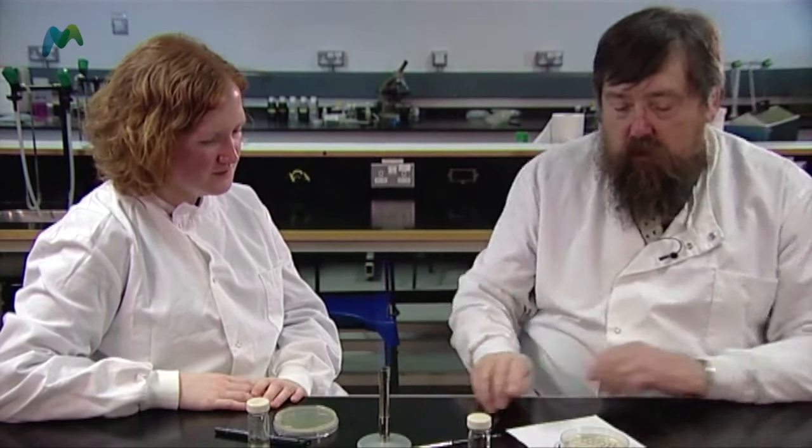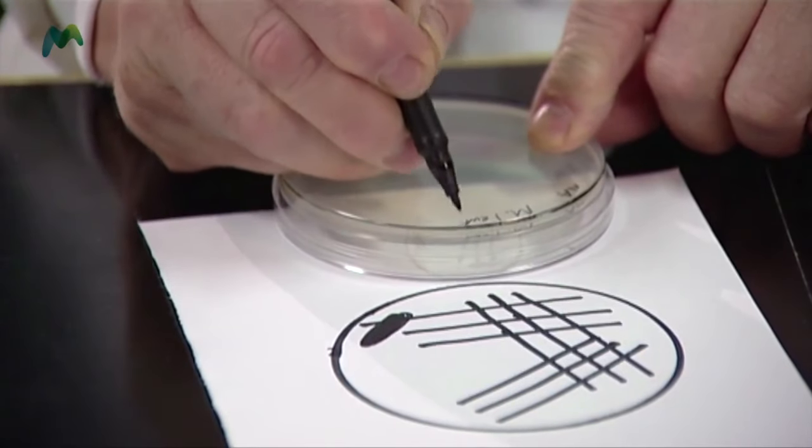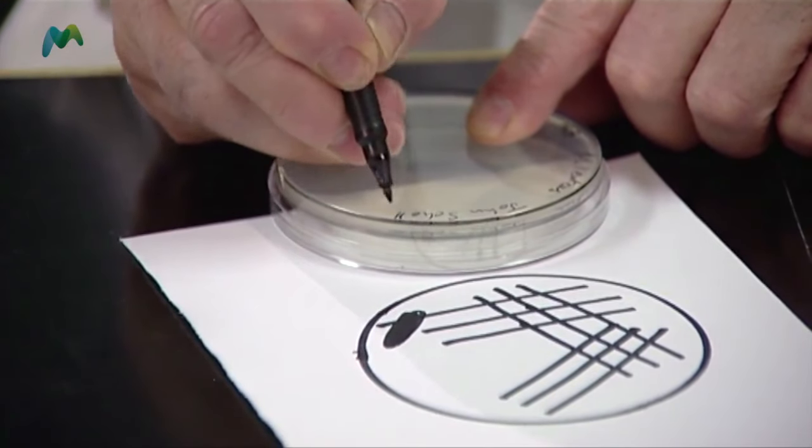Now I need to label mine as well — I'll label it Luteus, and put my name so that if it looks really good everyone will know it's mine, and I'll put the date too. The advantage of dating it is that if it's been in the incubator or left out for some time, people know how long it's been there, and whether there's any added hazard associated with it. The essential information is the microorganism name and the date.